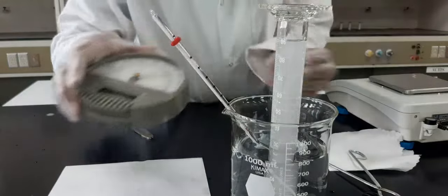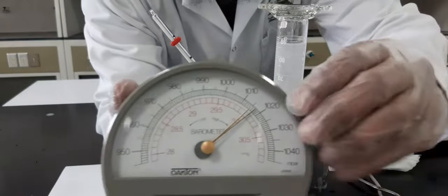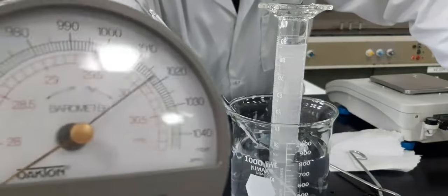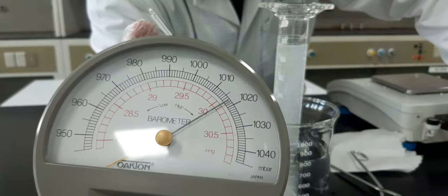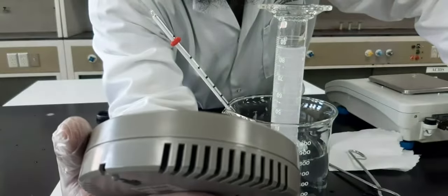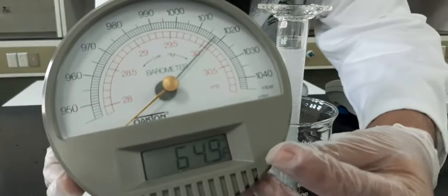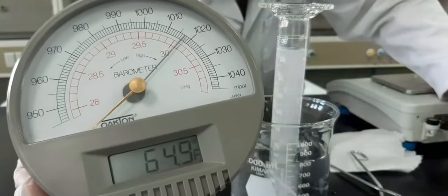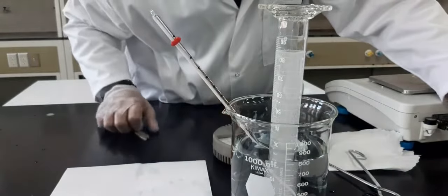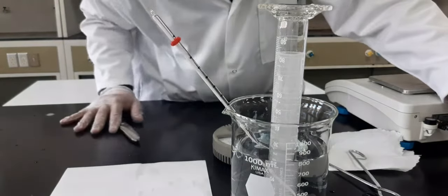So if you see, it says almost 1018. You can see that. Can you see that here, Shabab? It's the black digits and the gray line. So it's supposed to be closer to 1018. This is in millibar because the unit here is millibar. You're going to convert it into millimeter mercury. The conversion factor is normally given. If it is not, you just write 1018 and divide by 1.333. It will automatically convert into millimeter mercury.